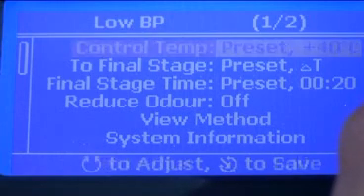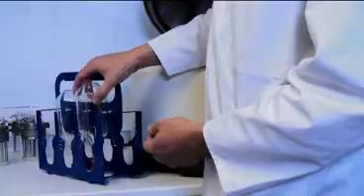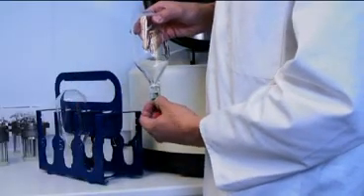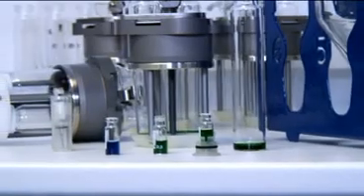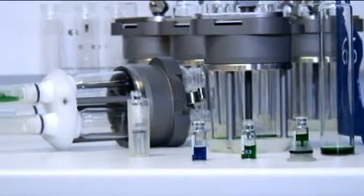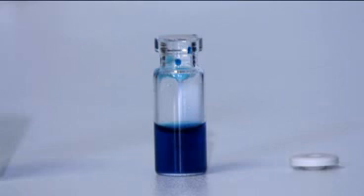The evaporation method is then set to evaporate the more volatile solvent, leaving the keep solvent behind. Alternatively, if using a larger volume, Sample Genie may be used with a concentration adapter. Sample Genie enables a large volume to be concentrated directly into a GC autosampler vial. The design of Sample Genie means that the vial is insulated from steam, and therefore the solvent in the vial does not dry — only the solvent in the flask.